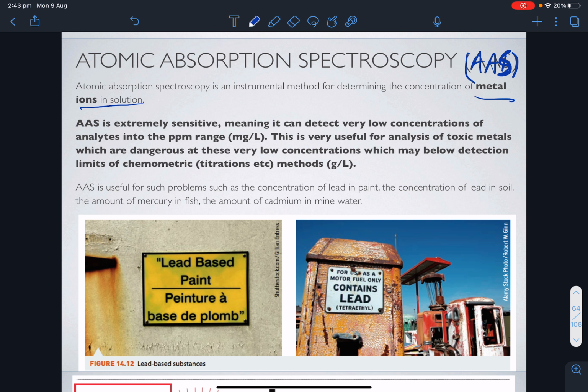And the mass of that precipitate would be so tiny that it would stick to the filter paper and you'd never be able to remove it, and you'd put it on your 2 decimal places digital scales and there'd be no difference and it would be lost. But still, it being there can be quite toxic. Okay, so very sensitive, it can detect small concentrations. So very good for trace metals, trace things, and toxic things.